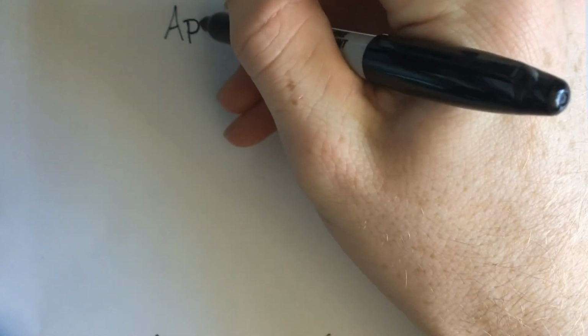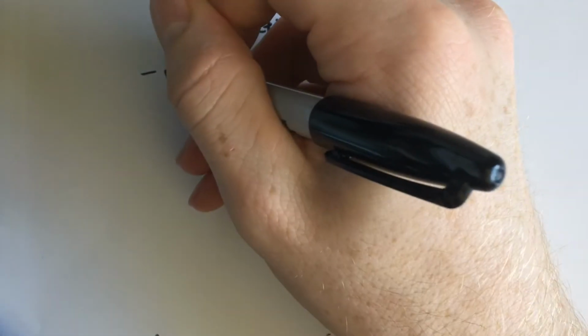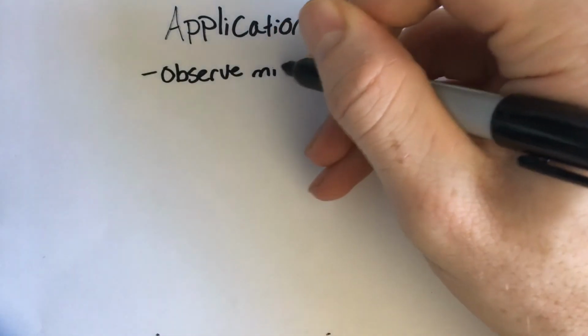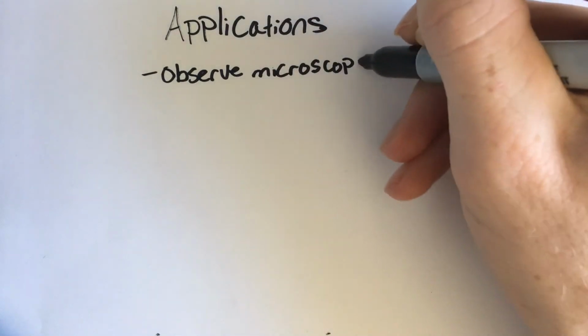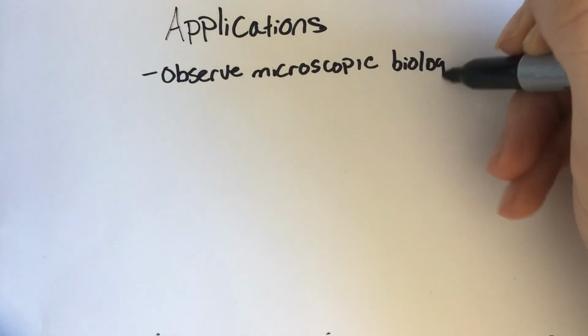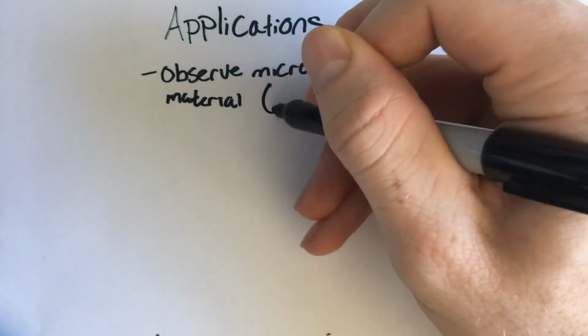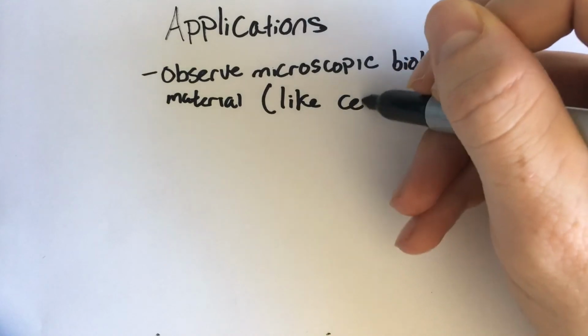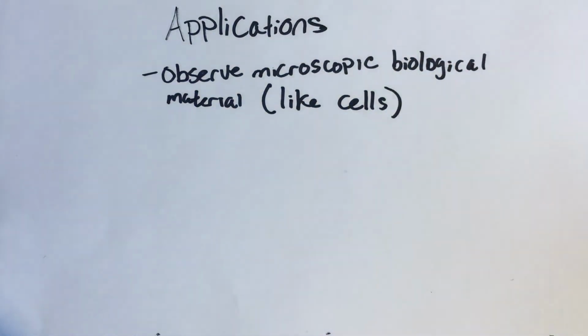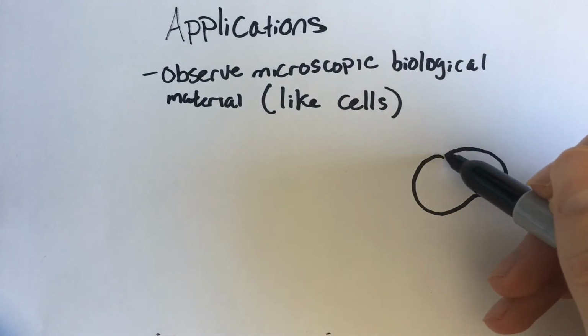Now, let's discuss some of the applications of photoluminescence microscopy. It's been used in a wide range of fields, so we're just going to talk about two small examples. The first being that photoluminescence microscopy has famously been used to image the insides of cells, and it can be used for most biological materials, where these are very complicated structures, and by incorporating some type of luminescent molecule, we can image them better. We can have those molecules go to specific structures.